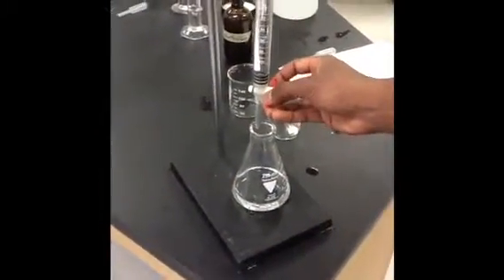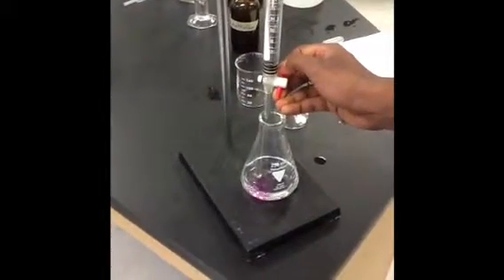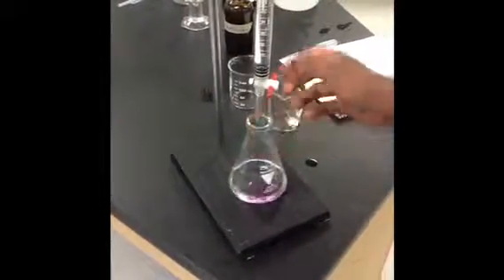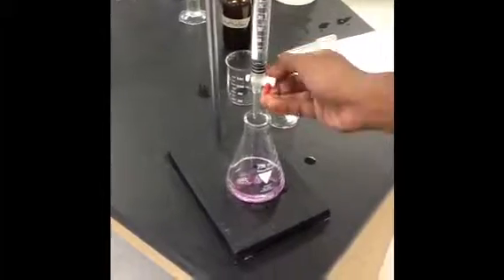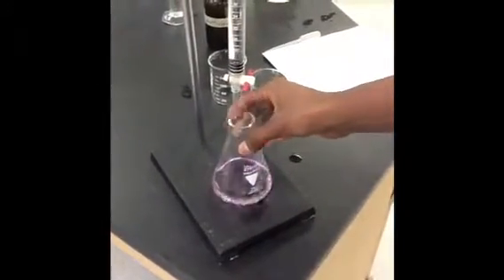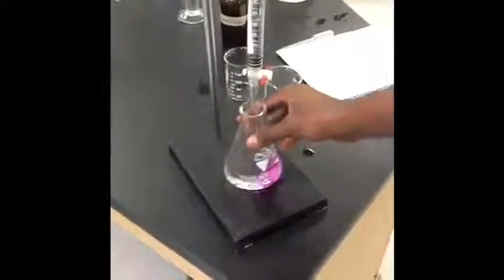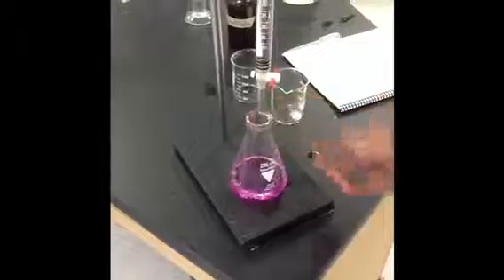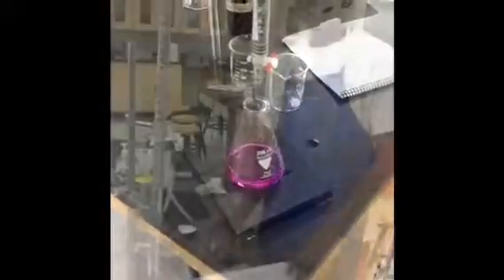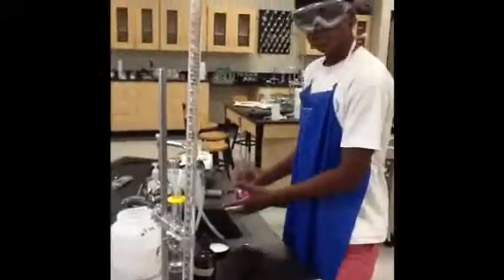And we're getting close now, so notice how it changes. See that color change? It's not there yet. And that, right there, is what the end color should be. Now, for the cleanup procedures, we're just going to take everything out and put it in the sink.